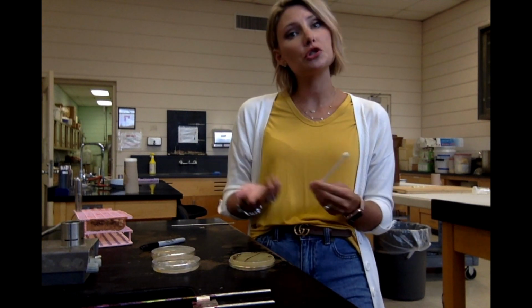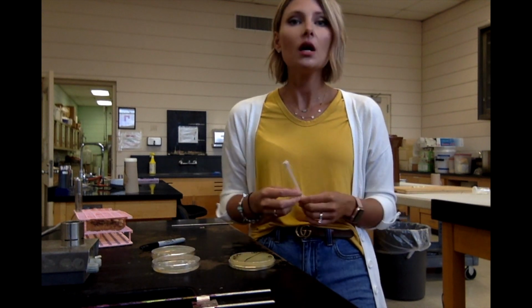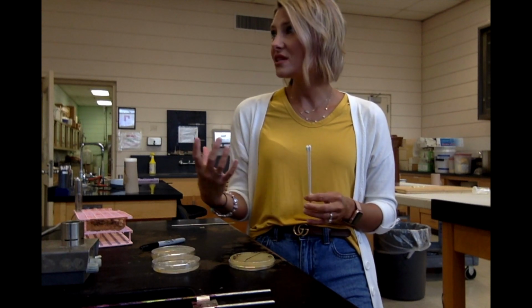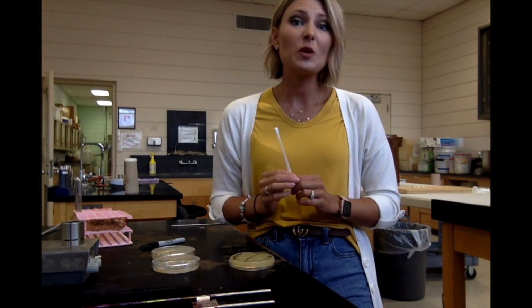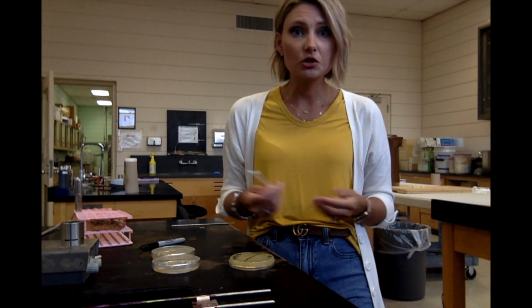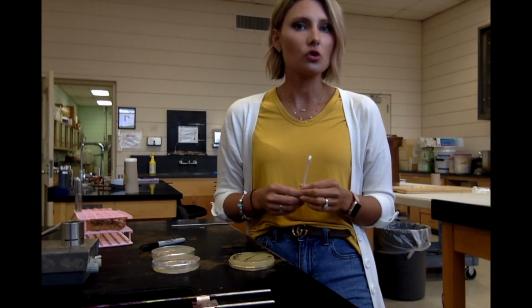The bottom of your shoe usually always gives really good results because you've been walking around outside. And then the water fountain, which is what I've also chosen, gives really good results. Now, door handles and things like that, places in the bathroom, a lot of times they will give you good results because people are touching those all the time. And then they have oil on their hands, so it's transferring and giving moisture. So usually the wetter the surface, the better your results are going to be.